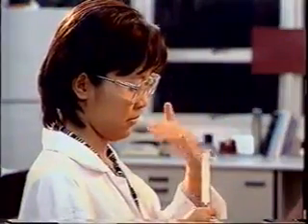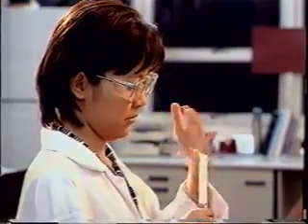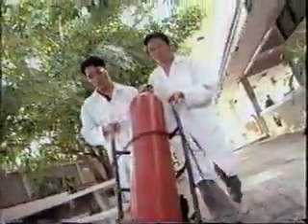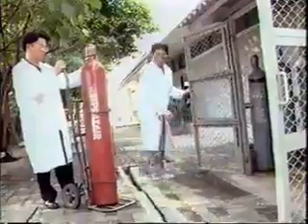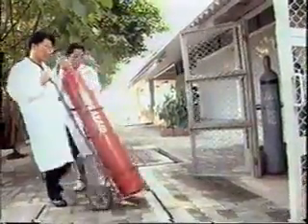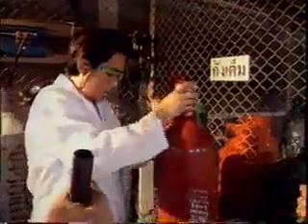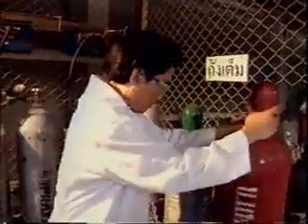If gases have to be smelled, waft them toward your nose. Gas cylinders have to be transported in proper trolleys. Make sure that the safety cap is always firmly attached when you transport gas cylinders. If a cylinder is too heavy for you to handle alone, get a second person to assist you. In the laboratory, gas cylinders have to be secured against toppling with a chain.